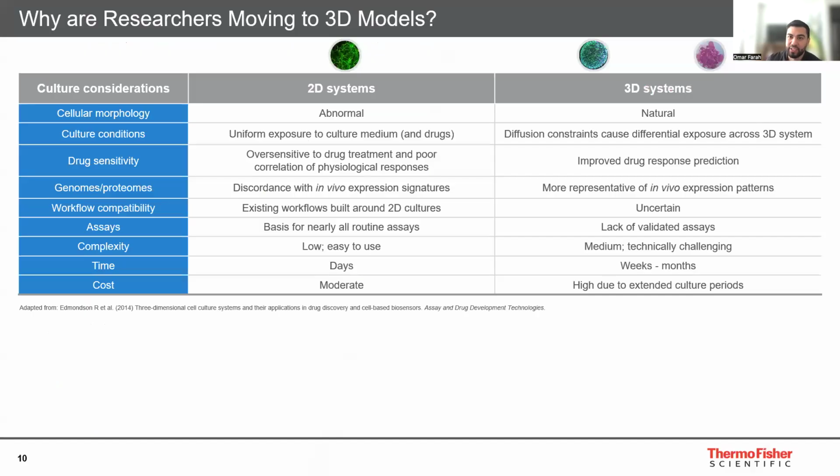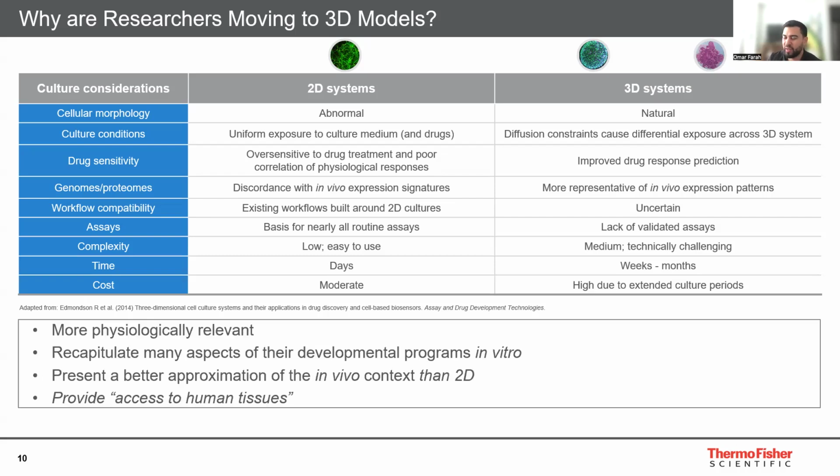So it's really important to note here that a lot of the differentiation protocols that you'll see will play in one of those two spaces, right? They'll be 2D systems or monolayer adherent systems, or 3D or slightly more complex or organoid systems. And there is a little bit of a gray area with co-cultures as well, but typically what folks are seeing, or at least claiming, is that 3D systems and models tend to be more physiologically relevant, right?